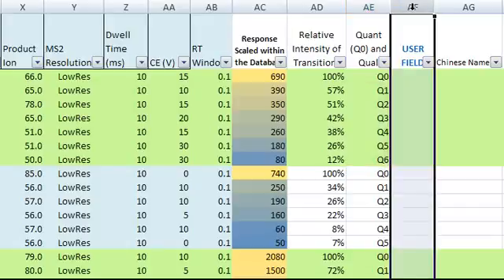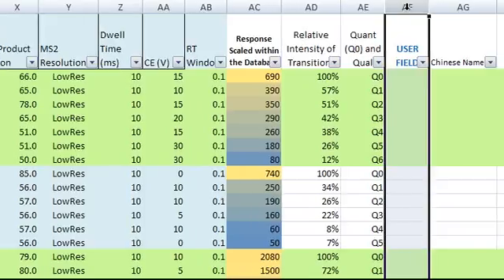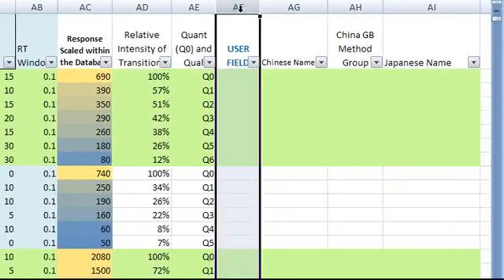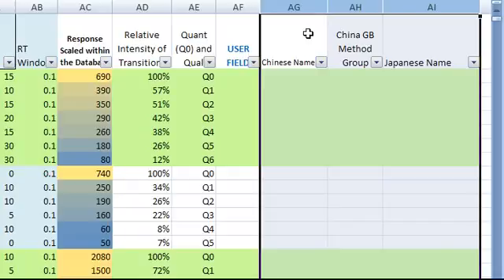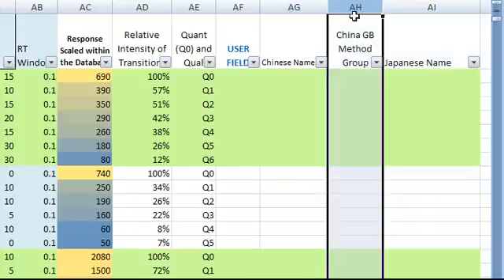The next column is another user field. We will demonstrate how you can take advantage of this user field column in the MRM acquisition method video. The last three columns are Chinese name, Japanese name, and the group number for the Chinese national pesticide method.